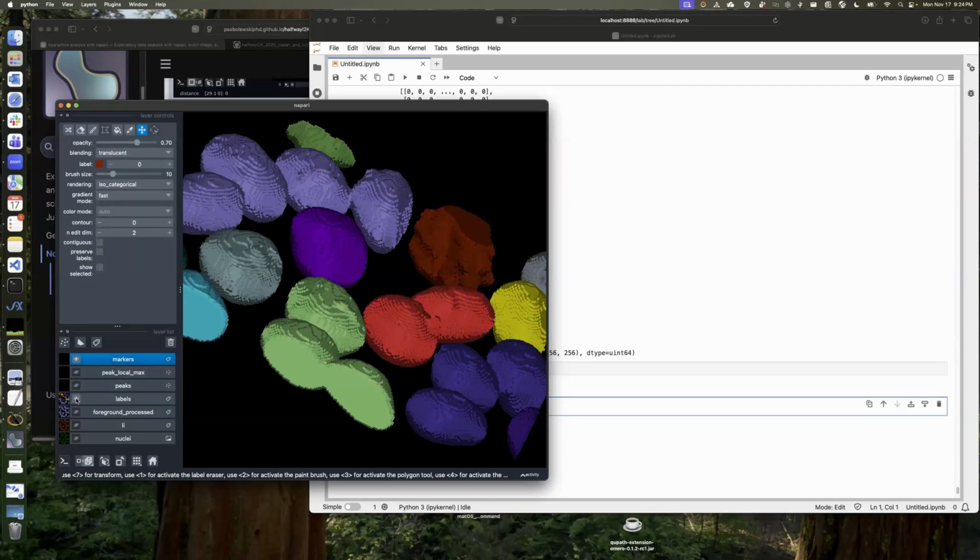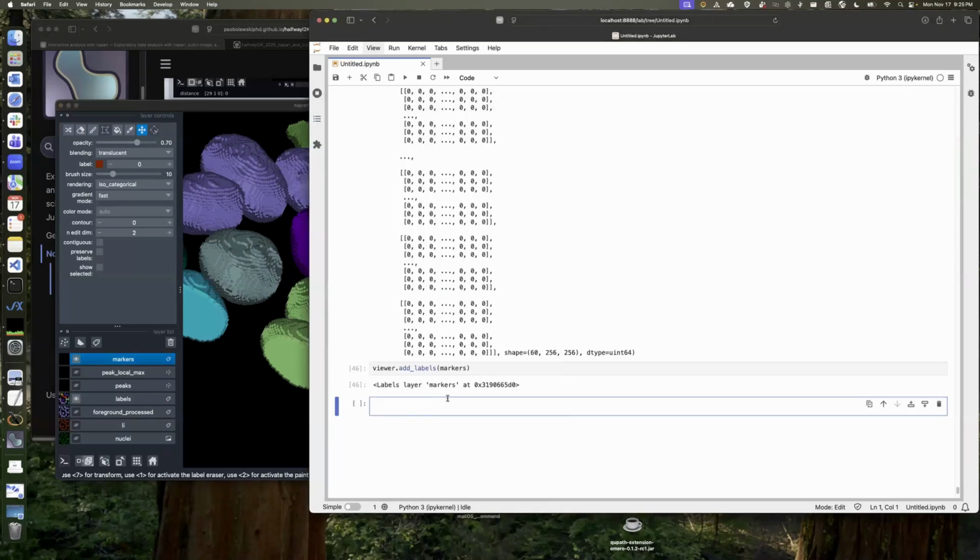And so we can use that watershed to break up these objects. So now we're going to do the segmentation using the watershed nuclei. So segment equals segmentation. That's the module from scikit-image. And then we will use watershed. Let's use the distance transform again. And we need to use the inverse of it because we want essentially negatives to be the basins. So smooth EDT. And then we want to use the markers.